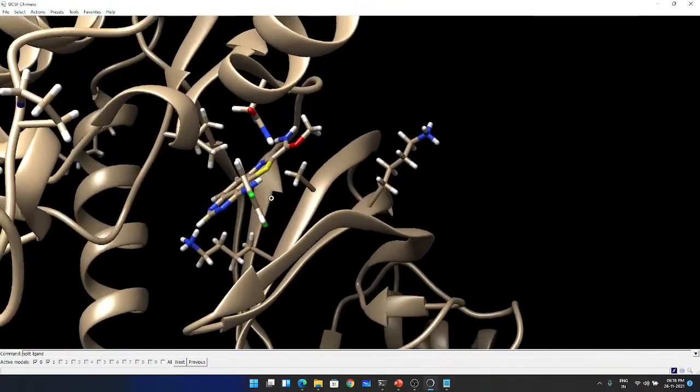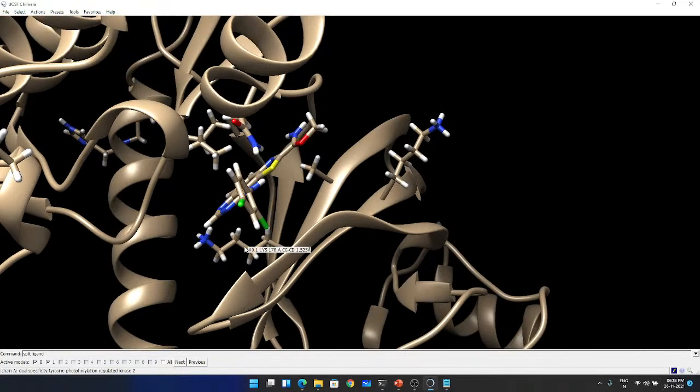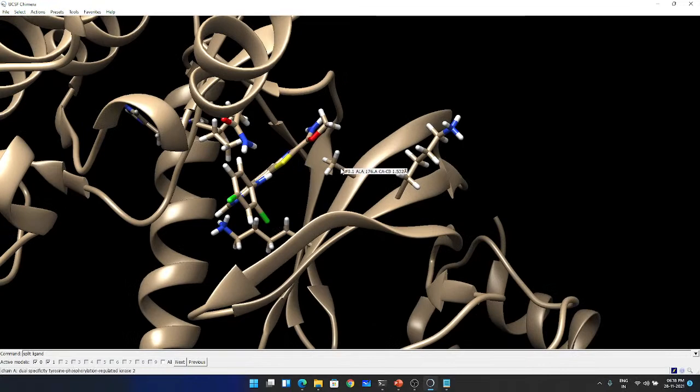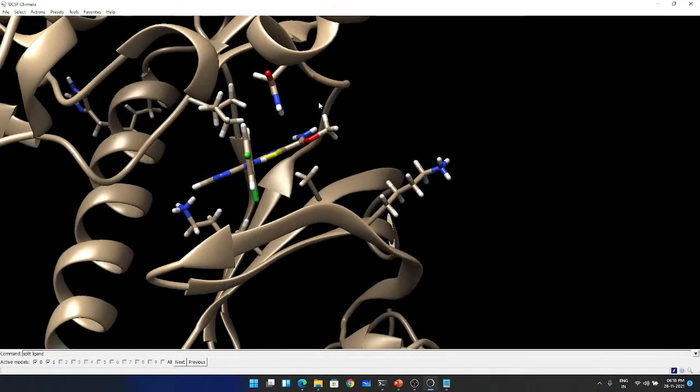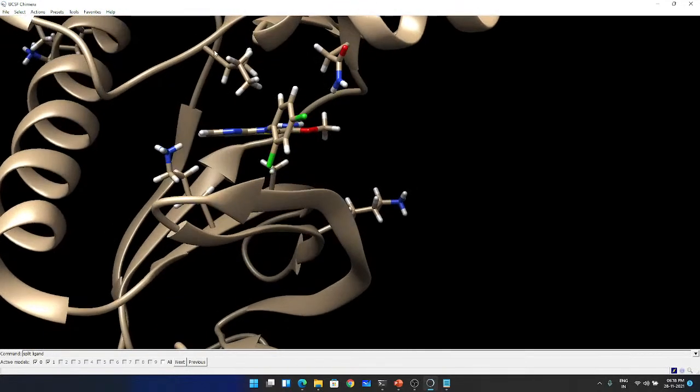So here you can see that the binding site of this ligand contains a lysine, which is on this side, which may be flexible because it's a very flexible molecule. Here we have another lysine. Here we have alanine, but again alanine has a very limited flexibility. We have here asparagine, which could be slightly flexible, and we have here isoleucine.